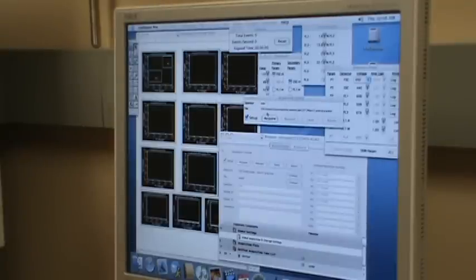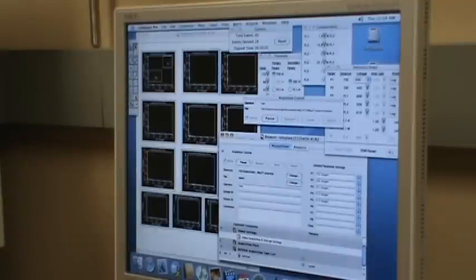Now let's do it again. Okay, now you see some signal there. You see FSC, forward scattering. Side scattering is in the vertical direction. The laser is here, your sample is here. The forward scattering is like casting a shadow of your sample.